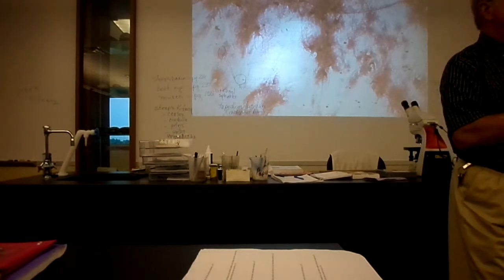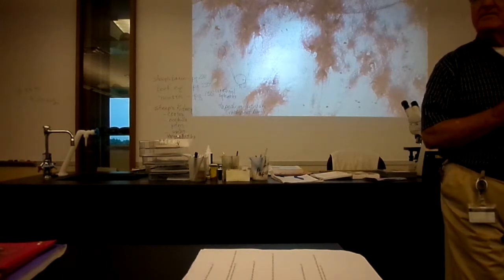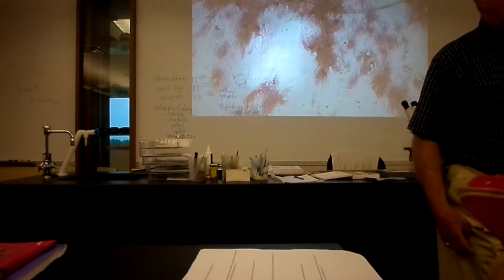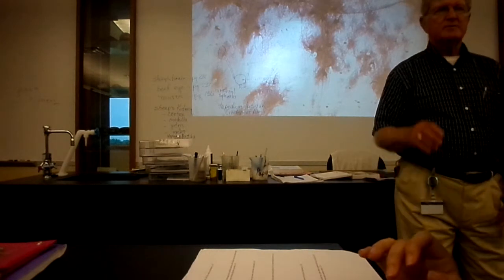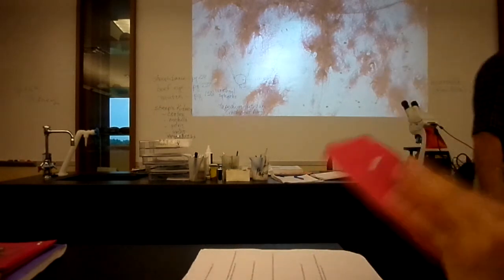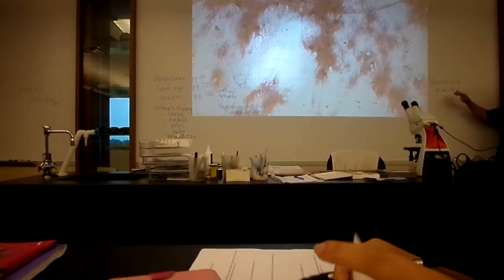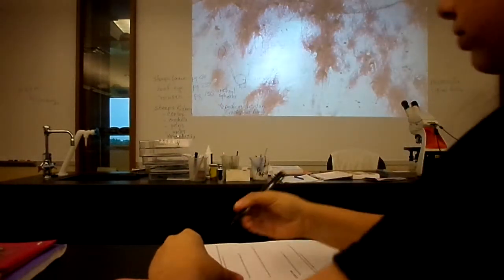Now, in addition to neurons, there is a lot of other tissue that makes up the spinal cord and brain of an animal. So I don't want you to get the impression that your brain is 100% neurons. In fact, the neurons are greatly outnumbered by neuroglial cells, or sometimes they're just abbreviated glial cells. This is basically the connective tissue of the central nervous system. And we're going to see that on this slide.